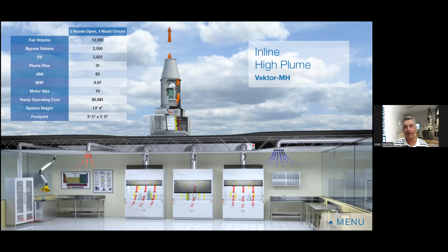So when I close the sash, we'll bring in outside air. When that sash opens back up and we need more air from inside the building, that damper is going to be closing down, all triggered off our building management system, which is monitoring this duct pressure. All day long, as sashes open and close, this damper is going to modulate to ensure that we keep this green light green and avoid overpressurization or underpressurization in that space. So that's the common approach to operate these types of systems.